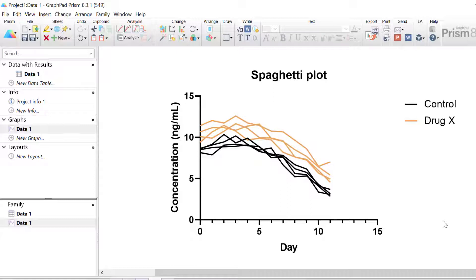That is our finished spaghetti plot for the first variation where the different groups are coloured differently. All of the control group is coloured in black whereas all the lines for drug X are coloured in yellow. However, you may wish to colour the lines differently for each replicate in the experimental group — for example, if you were only interested in the data in drug X, you could colour each line differently for each replicate or subject.